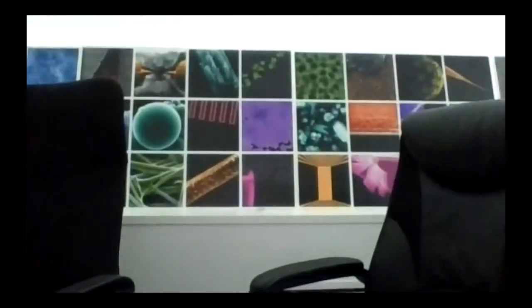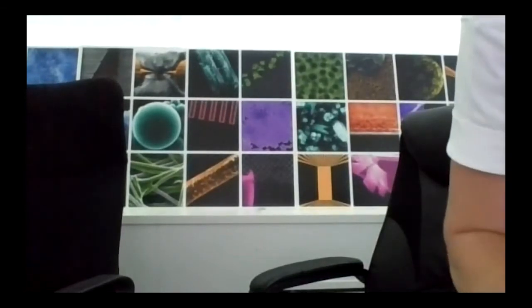And unfortunately, by this camera, you cannot see anything in the chamber. So I will show it to you by a chamber view in the microscope. So just wait a minute. We will remove that one, because it's impossible by that camera. And I will pump it. So I will switch here.